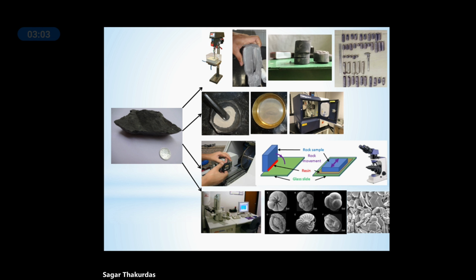Then it is ground and made smooth, and then we put the cover glass and all those things, and finally it is observed under the microscope. Now I'll tell you what is the difference between this optical study and XRD study.